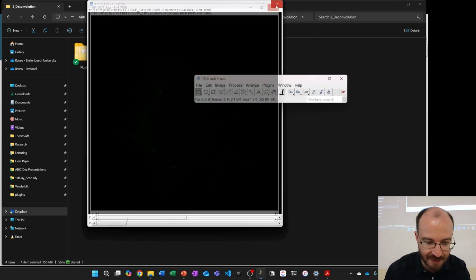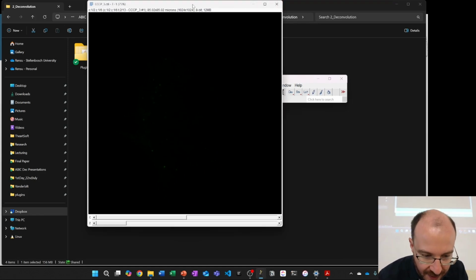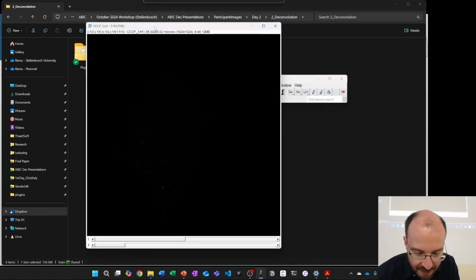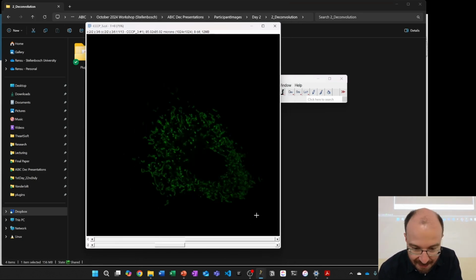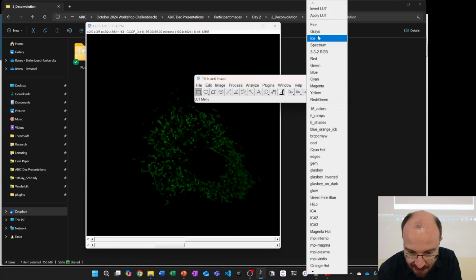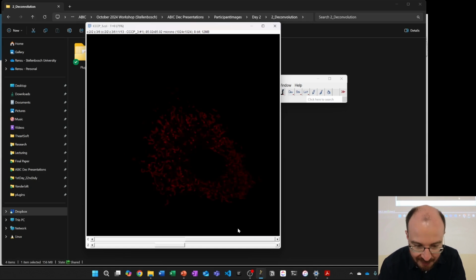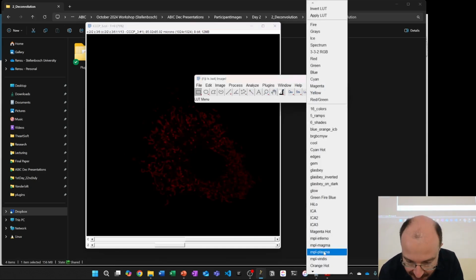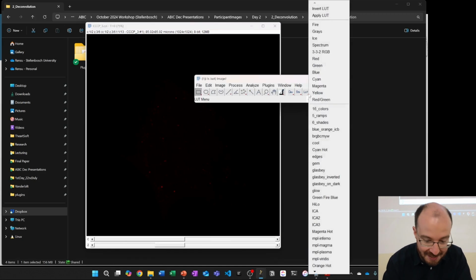I'm just going to close all of them so that I just have one left for now for my example. There you go, just one left. And as you can see, there are two channels here. Both of them, for some reason, are shown as green. I'm going to, for the sake of it, just make the mitochondria, I don't know, red or something. Just maybe make it a bit more distinguishable. I know both of them are red. Okay, that's not helpful. Let's just use viridis. All right, so now the one is red and the other one is viridis.